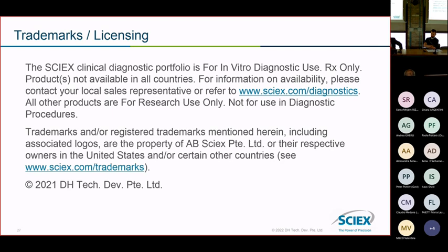So we can either use the Waters M class or the EvoSep. I think both work really well. I think the key feature is the column. And the lower you go, the more impact the overhead times can take. But if you go fast, that's less important. But you're not fast. Your runtime is 1 hour.